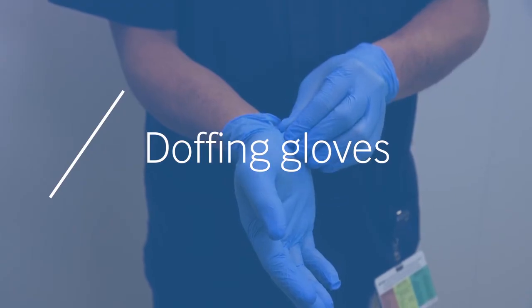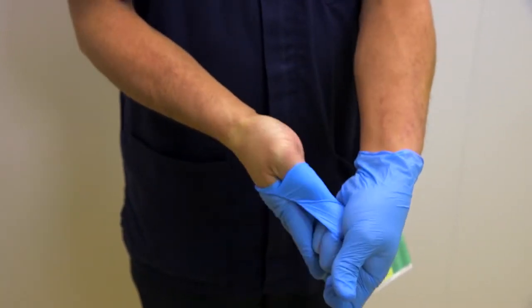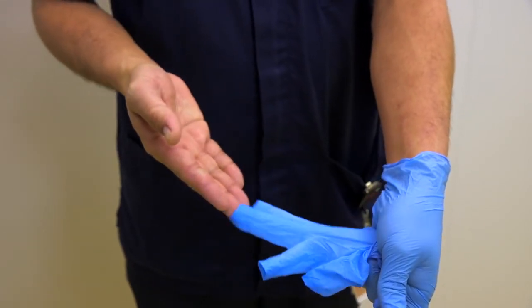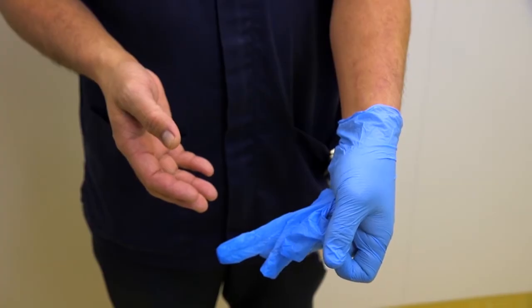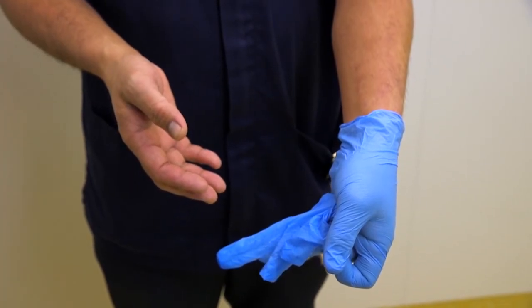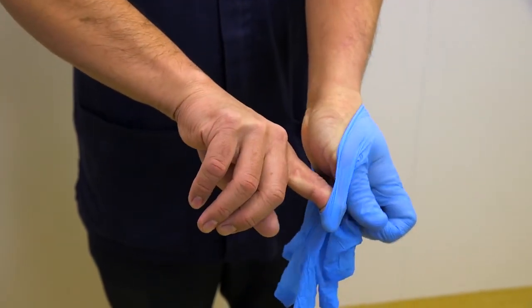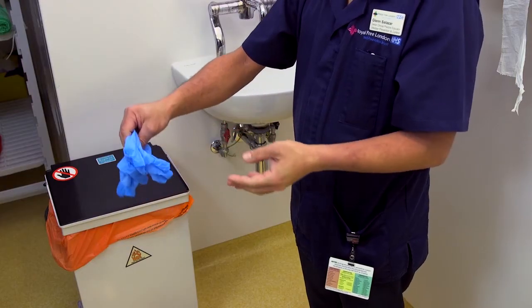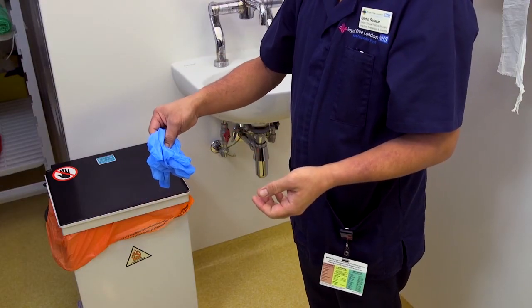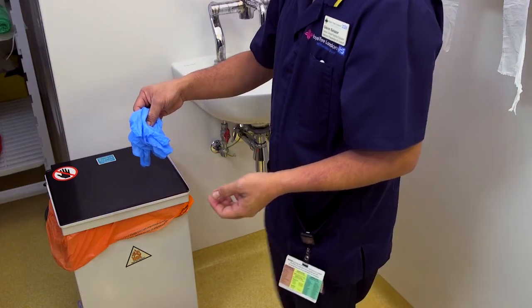To remove gloves, pinch the cuff of one glove and pull it off the hand inside out, so the contaminated surface is contained within the glove. To remove the second glove, hook a finger into the cuff and again pull over the hand so it is removed inside out, and all the contamination is contained within the gloves. Discard into the bin.